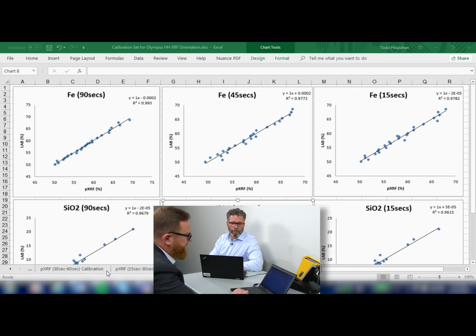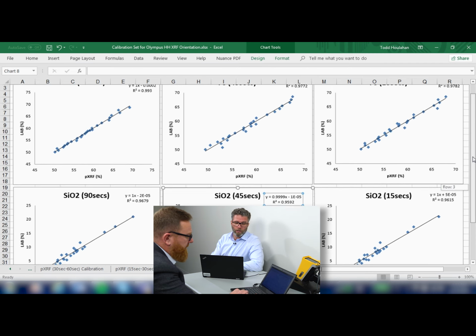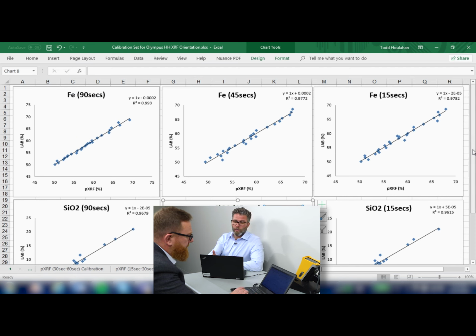Okay, here's an example of a customer who's done an orientation survey to optimise their test times under different scenarios, 90 seconds, 45 seconds and 15-second tests. Marcus, you know more about this project than me. Tell me more. Well, Todd, interestingly enough, if we look at the comparison graphs, we have a heavy element and a light element. As we stated before, sometimes you need a longer testing time for particularly light elements, magnesium, aluminium, silica. If we look at the correlation coefficients for both of those elements along the testing times, if we go from 90 seconds to 45 seconds to 15 seconds, we see the correlation coefficients don't actually change that much. Hence, the customer is getting higher throughput and achieving the data results that they are after.